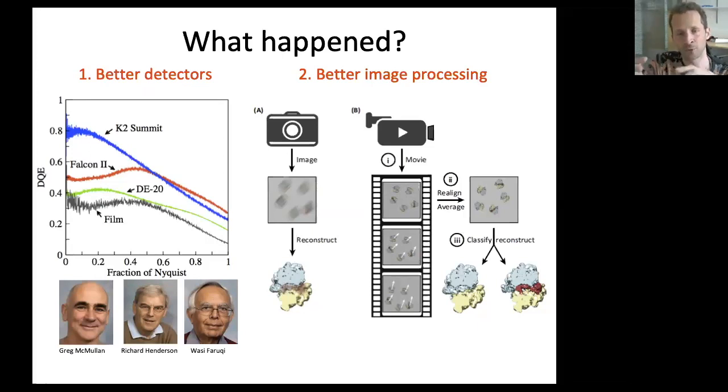And so what you're basically doing is taking pictures of moving objects, and you would have to take a 1 second exposure. If within that 1 second your whole molecule moves by a nanometer, then that will, of course, limit the resolution that you can get from the reconstruction from those images, because the motion will blur out the image. Now, the new detectors were digital cameras, not unlike the ones in your phone, which you can put in burst mode. So now suddenly we could collect movies, and the movie frames could be aligned to correct for that motion, and that gave even higher resolution pictures.